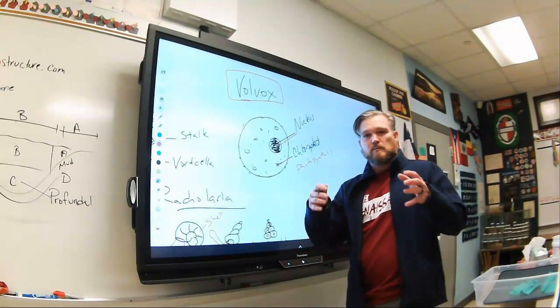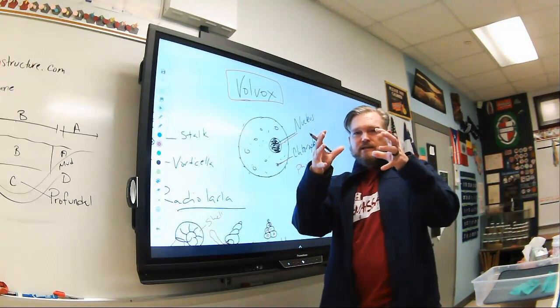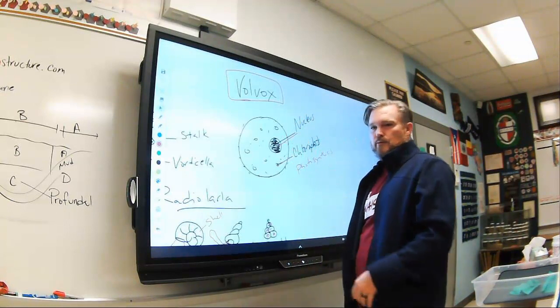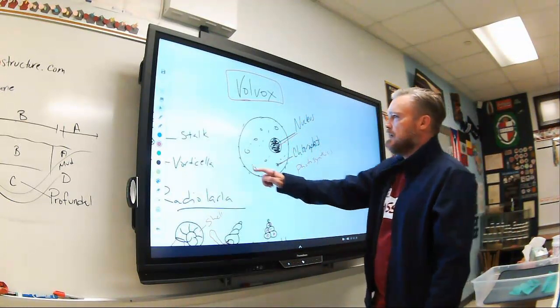They're really cool when you see them living. They're green, and they just kind of float through like a big old beach ball would be floating through on the slide, so they're kind of cool.